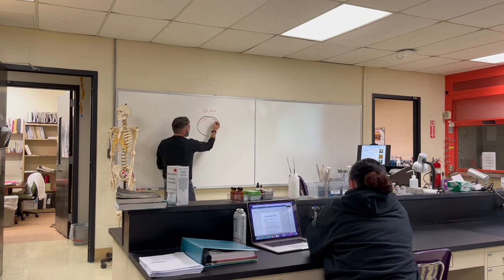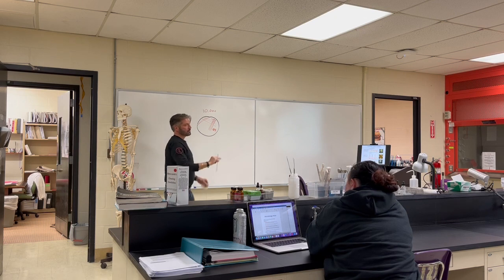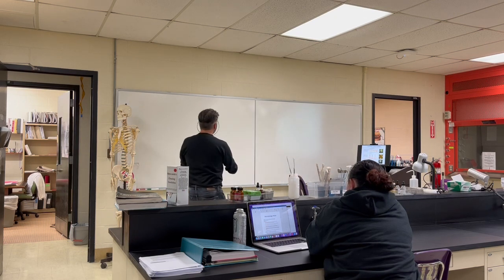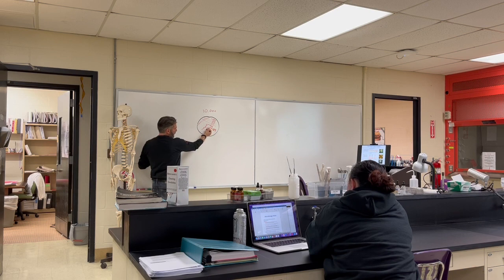Swab it through here. Let's just say I have 23. Sterilize again. Come over, and now you can do whatever you want with this. I'm going to draw it through here and kind of do that. Draw it through here and kind of do that. As I swipe it through here, I picked up 1 or 2, came down here, and hopefully I dropped one off here, one here, one here, one here, and one here.